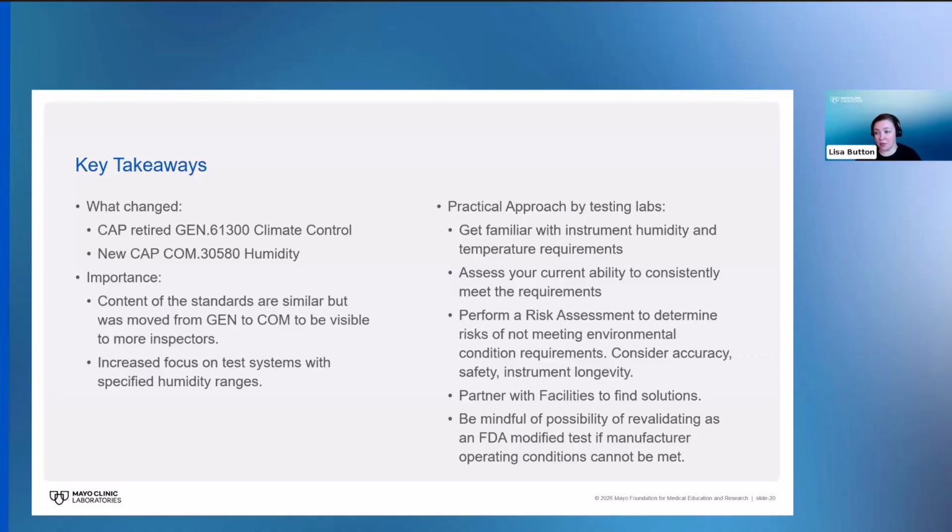I would suggest performing a risk assessment to determine risks of not meeting environmental condition requirements. So consider accuracy, safety, and instrument longevity.